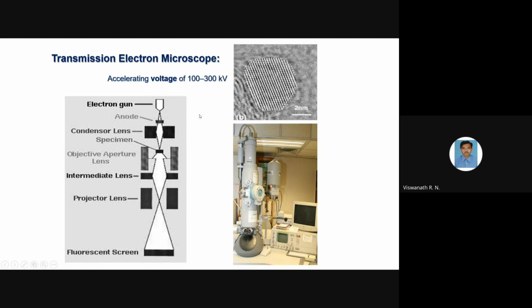Then another one is the transmission electron microscope. Similar to the scanning electron microscope, the transmission electron microscope also works with an electron beam of high energy.